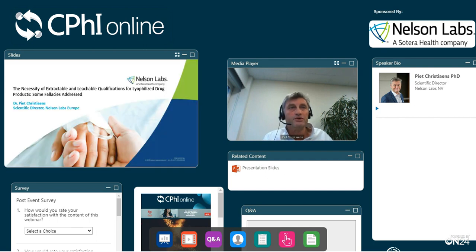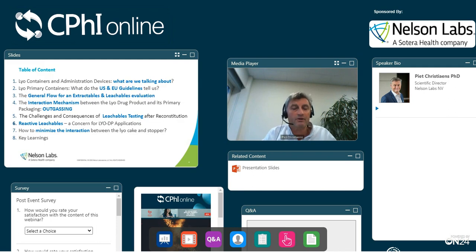So I'll immediately go to the table of content. In the first part, we will have a look at the primary packaging containers for freeze-dried or lyophilized drug products, as well as some of the most common administration devices or drug delivery devices that are used for reconstitution or after reconstitution. In the second part, we will have a look at the US guidances and European guideline and what kind of information they give us in terms of depth that is needed for the qualification of the primary packaging of the lyophilized drug products.